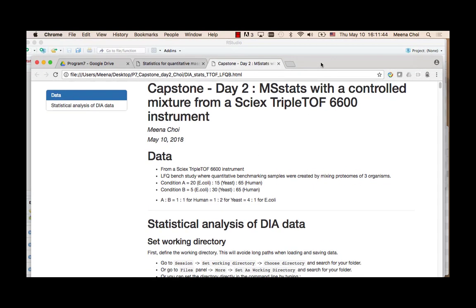So I think from 4:30, Brandon will start the next data set. But for 20 minutes, please run. I will go around, and if you have a question, let me or the TAs know.